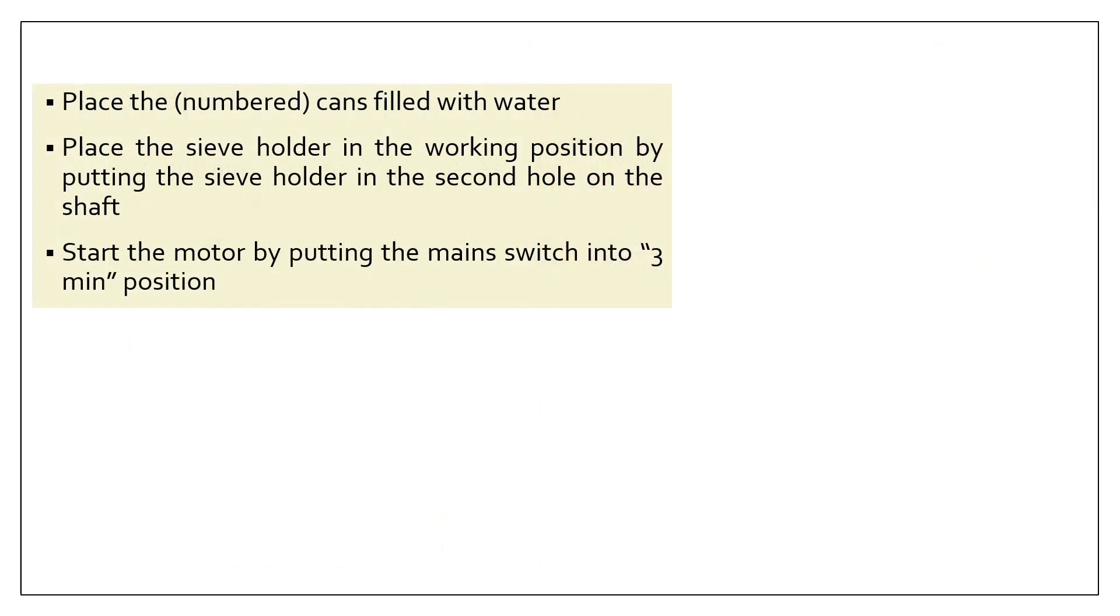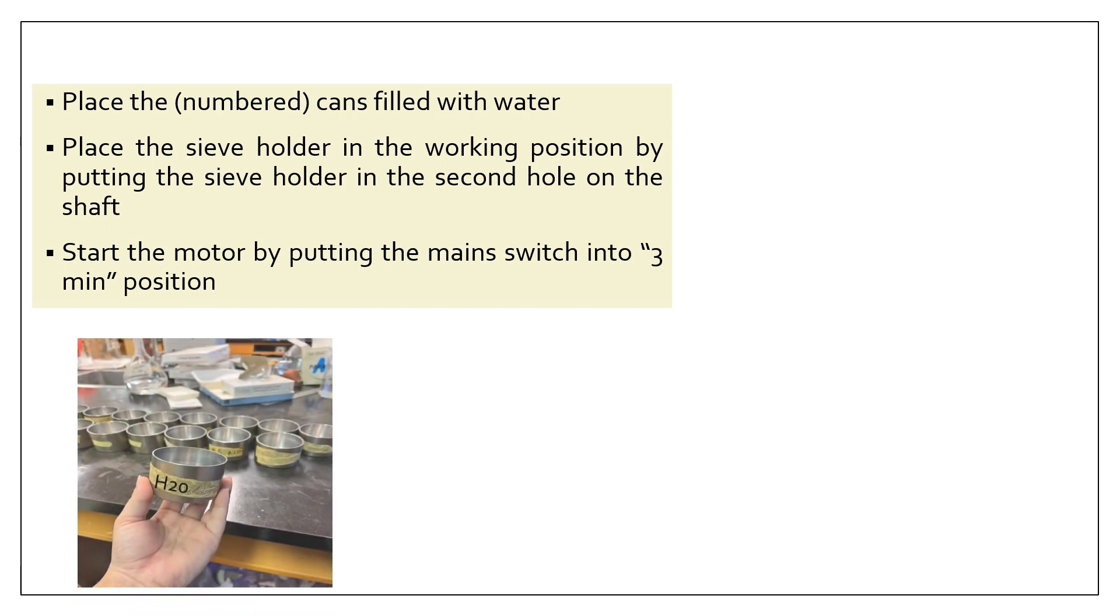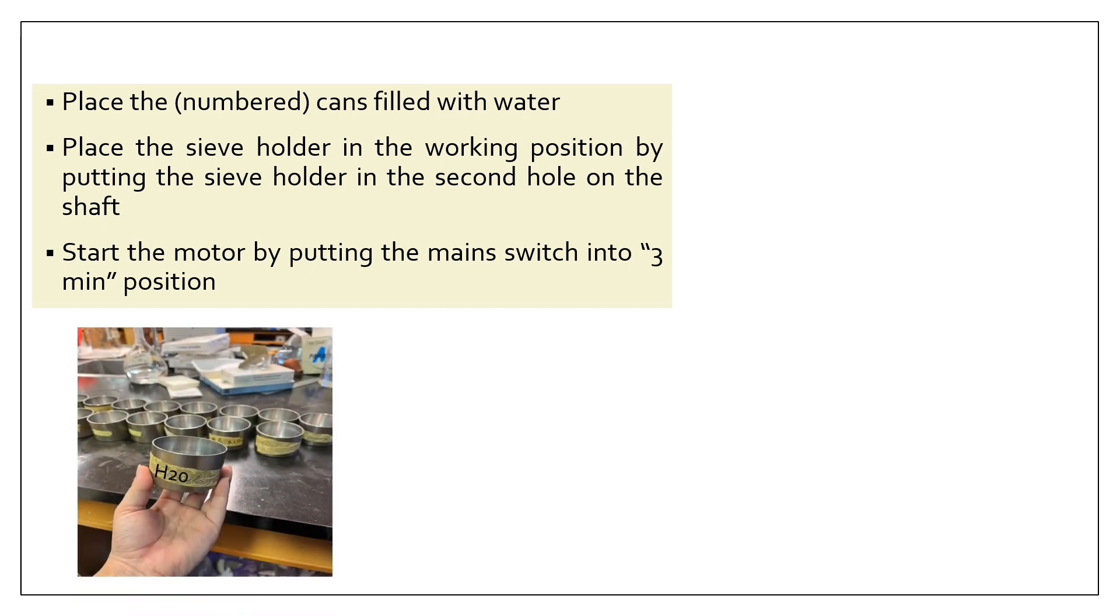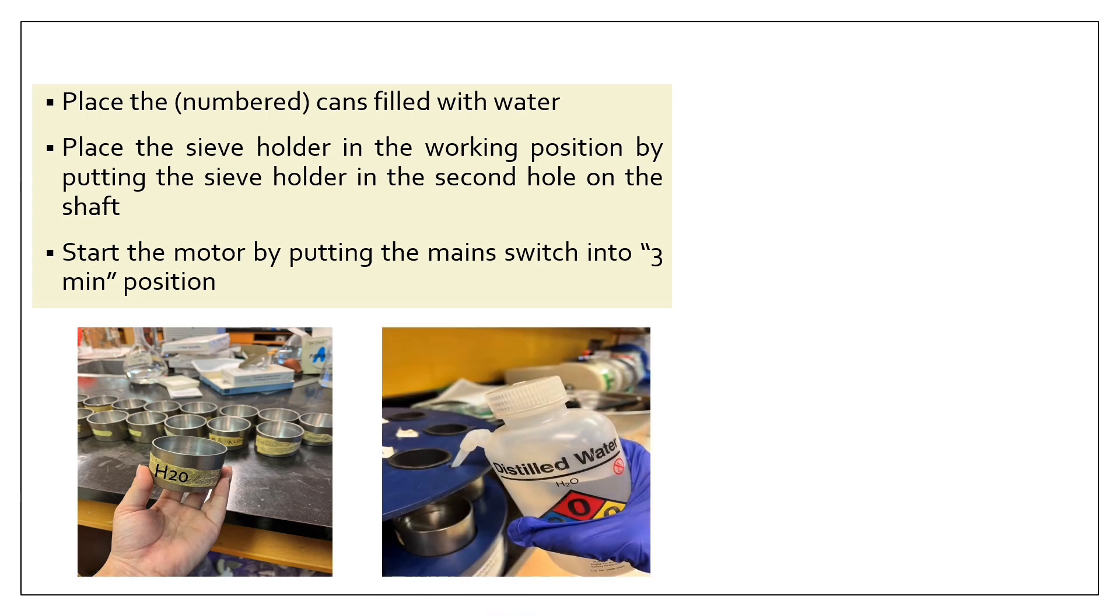Now place the cans filled with distilled water. These are the cans - there are 16 such cans, 8 for the water and 8 for the chemical ones, and they can be labeled as water and chemical for your convenience.